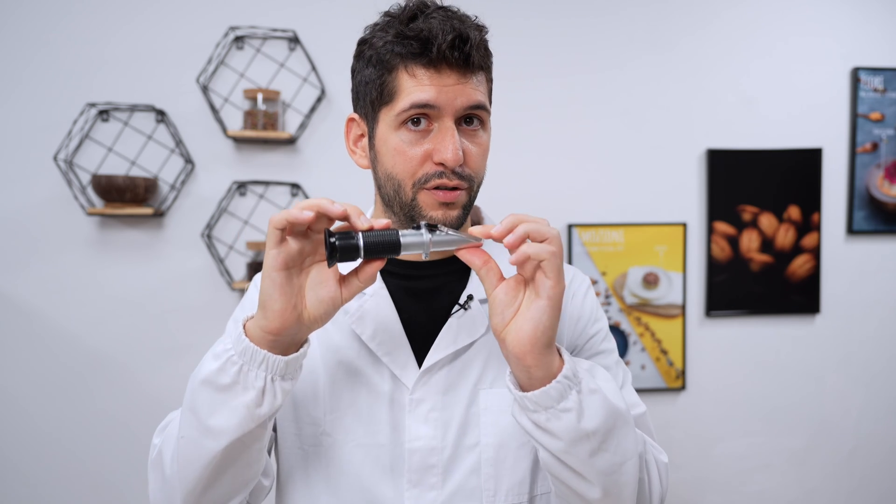We can calibrate one of these instruments to measure sucrose present in water, giving a correspondence between the refractive index and the percentage of sugar. This is called the Brix scale. With an instrument calibrated for sucrose, we can measure how much sucrose is dissolved in water. However, if we have fructose or dextrose, we need a refractometer recalibrated for those. This is one of the first mistakes made in a lab — approximating all sugars as the same type. The most useful refractometer in a gelato lab is the one calibrated for sucrose.